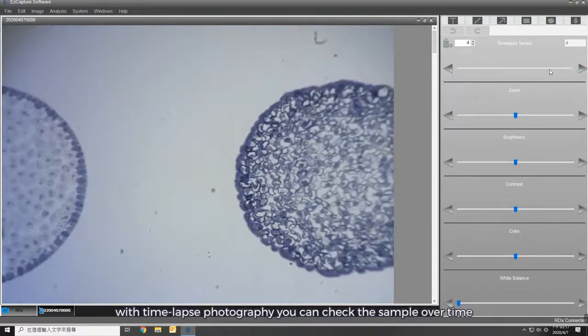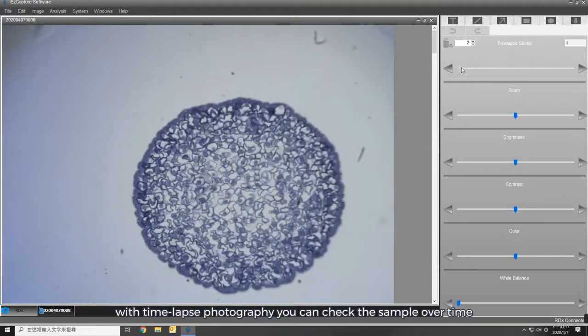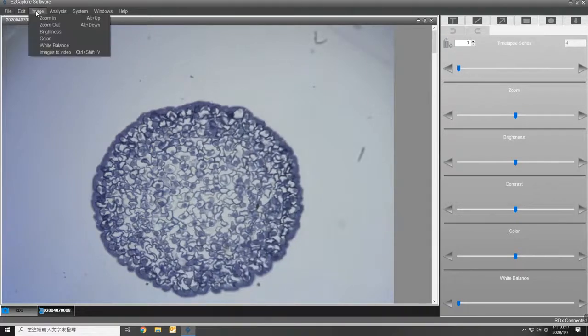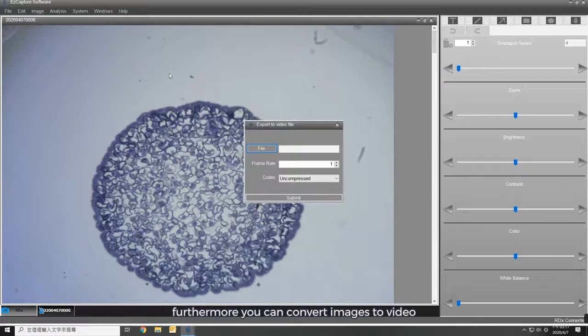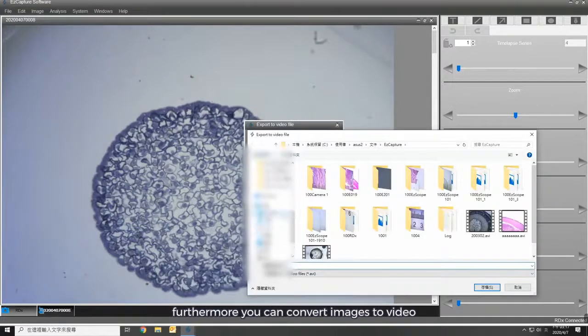With timelapse photography, you can check the sample over time. Furthermore, you can convert images to video.